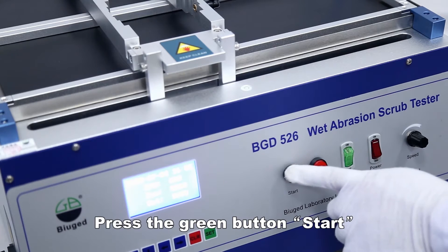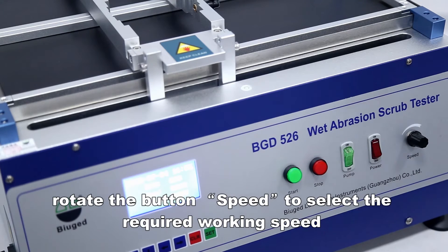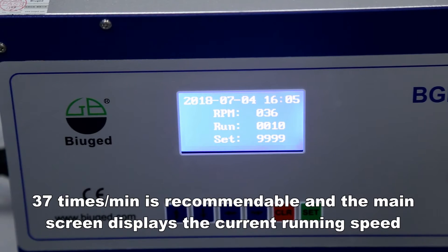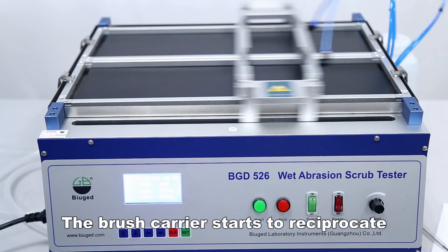Press the green button to start. Rotate the speed button to select the required working speed. 37 times per minute is recommended, and the main screen displays the current running speed. The brush carrier will then start to reciprocate.